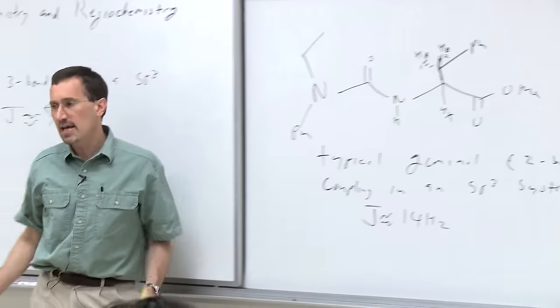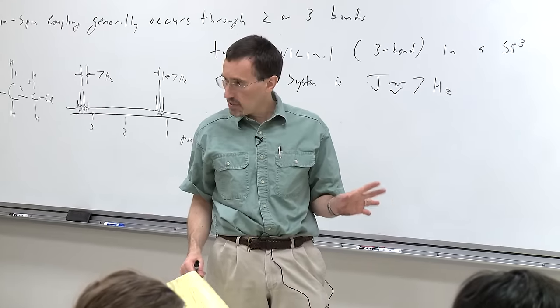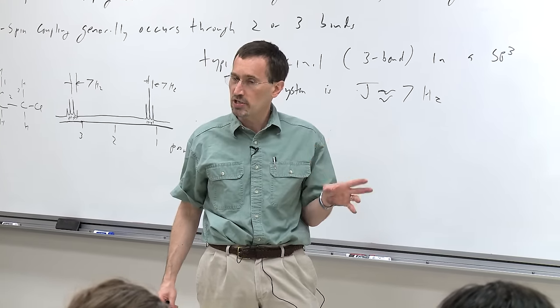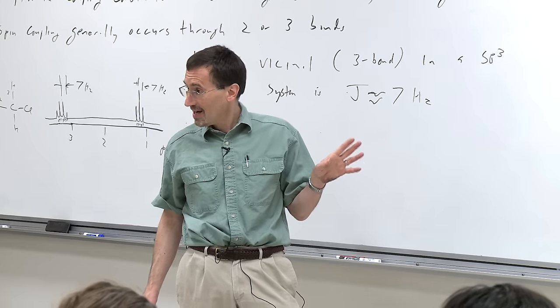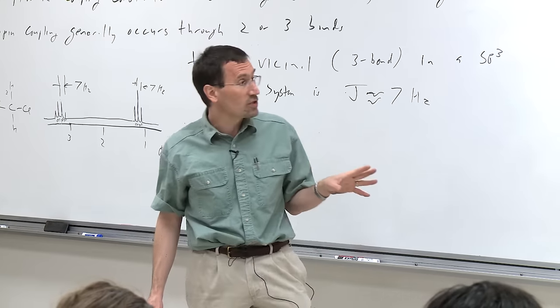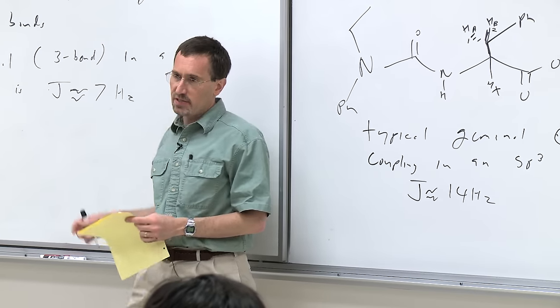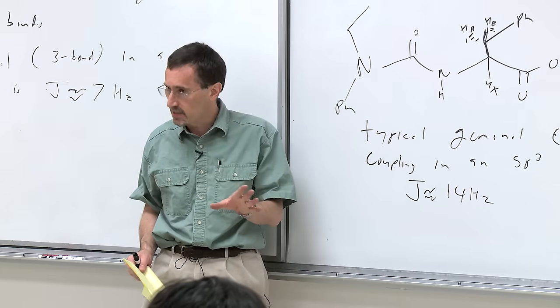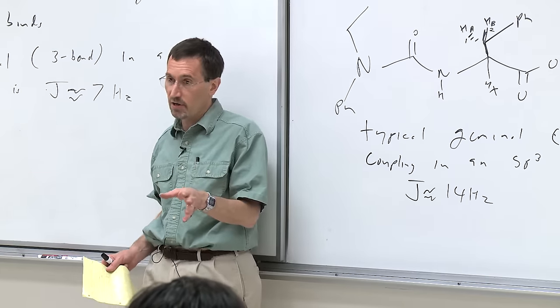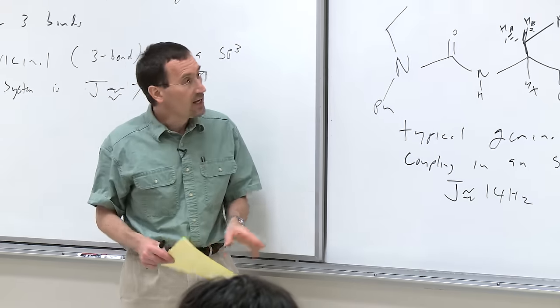Geminal couplings tend to be really sensitive to substitution and particularly to hybridization. In just a moment, I'll show you a geminal coupling of 2 hertz to give you an idea of the extreme. Vicinal couplings also are sensitive to substitution and hybridization, but not quite as sensitive. I'll show you vicinal couplings of 10 hertz and 18 hertz, or 11 hertz and 18 hertz, in just a moment.